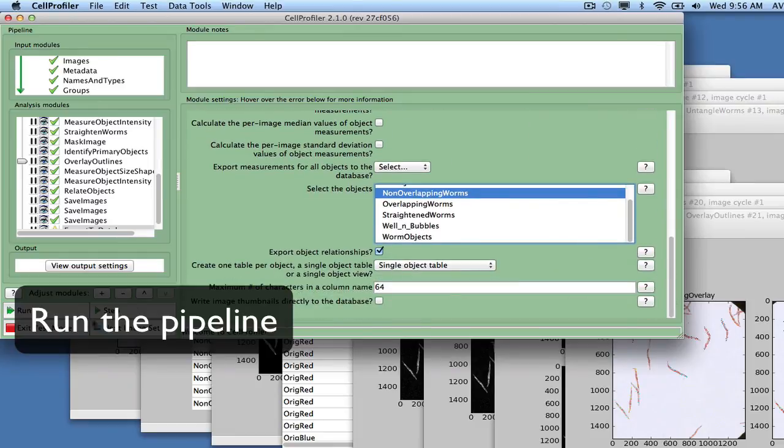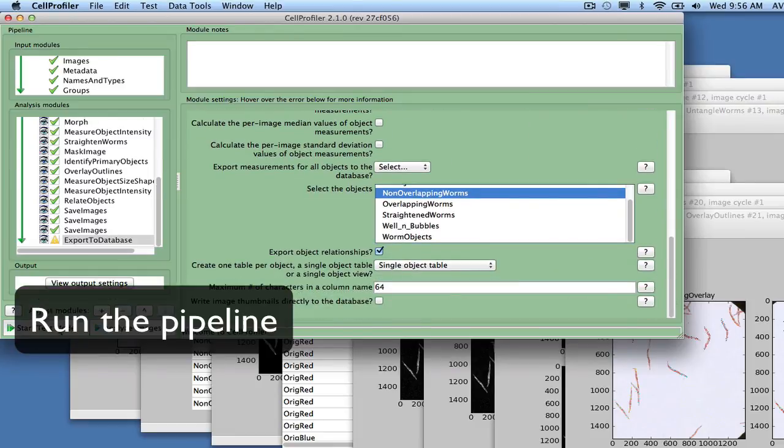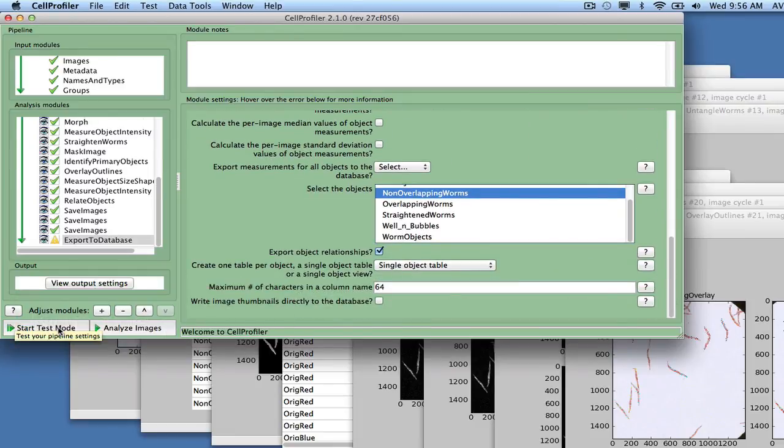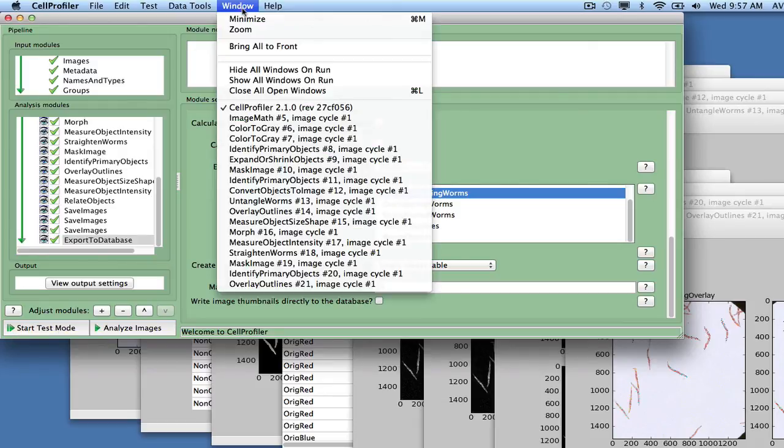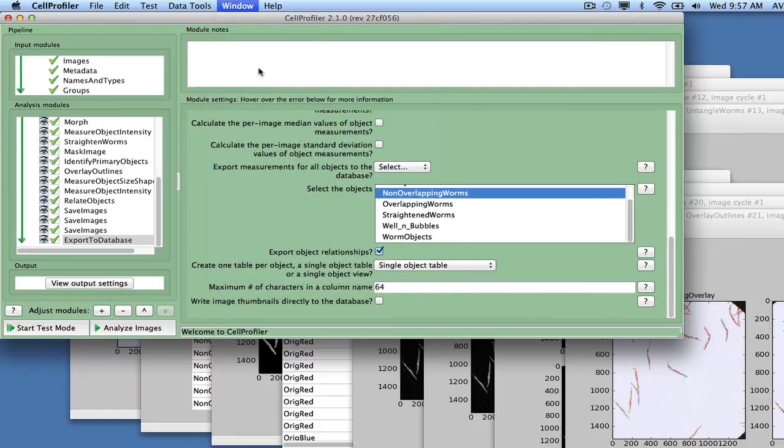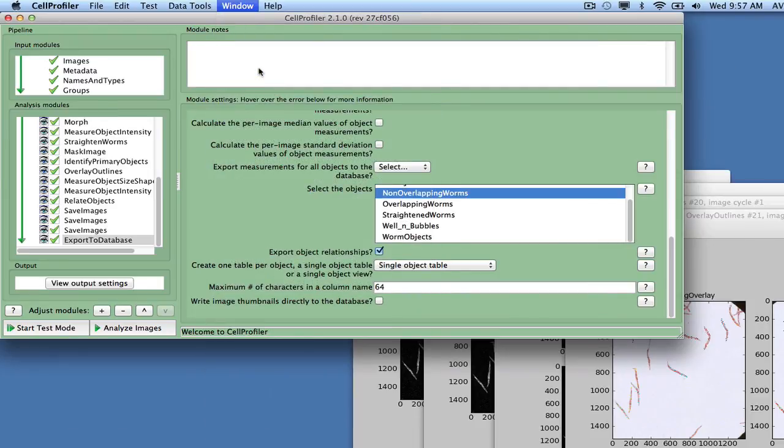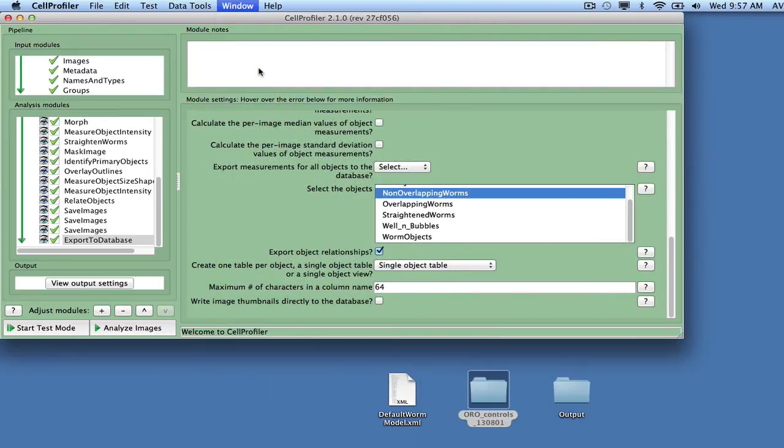Your pipeline is now complete, so exit test mode by pressing the Exit Test Mode button. Since we have finished previewing the results, the display windows can be optionally closed to save time and memory during the analysis run. Select Hide all windows on run from the Window menu item to close all the display windows and have them remain closed during the analysis run.